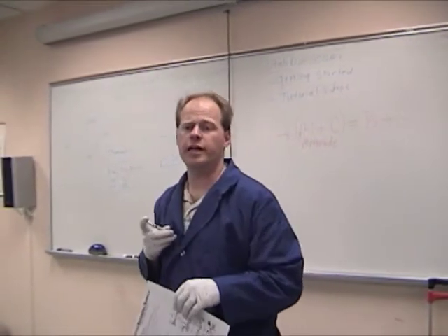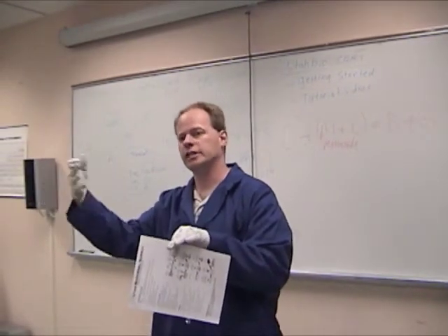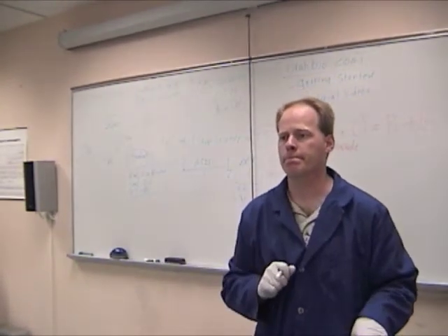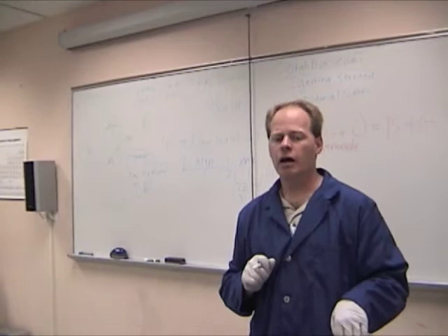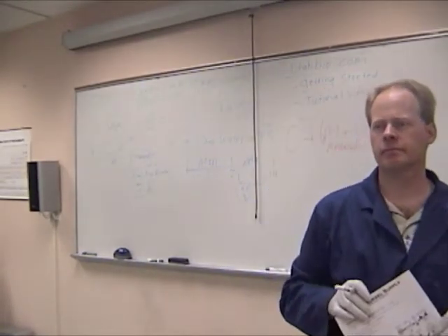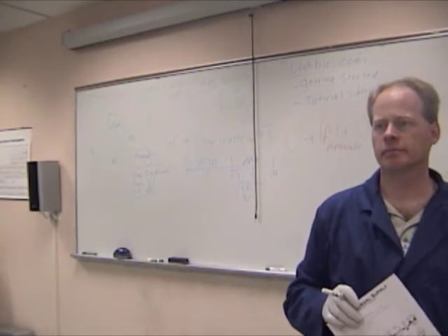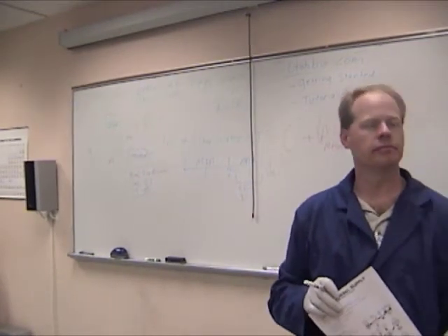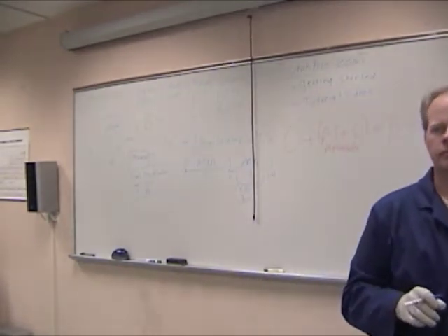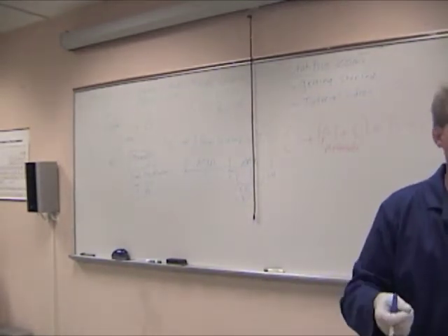It tells me what the pH is, and if the pH is above a certain level, it's going to change color. That's all I've done. So instead of adding the drops into your cup, it's already there. What you're saying? No. All that does is identify that to me as being the indicator solution. I use a lot of indicator solution. That is just for my own recognition. That's why Graydon's is clear, and mine is purple. I just identified it that way.